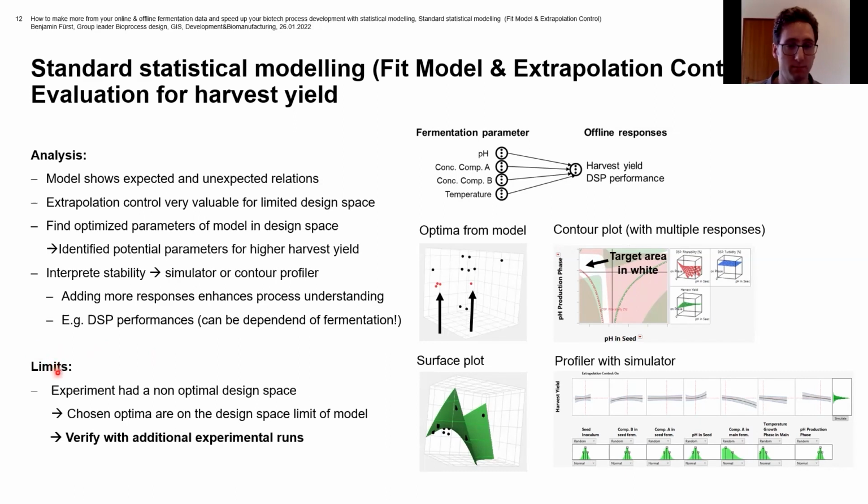Okay, especially here, because of this limited design space, you have to verify the results with additional experimental runs, because the optima we chose for the profiler are on the limit of the model. So you have to be sure that those are correct. But in this case, we just use them to guide us in the correct directions for parameter setting.